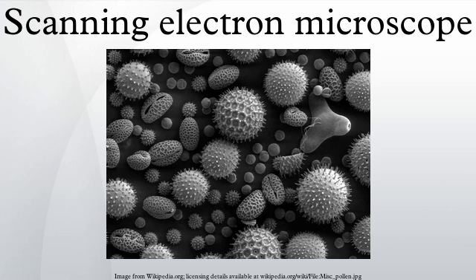Backscattered electrons are beam electrons that are reflected from the sample by elastic scattering. BSE are often used in analytical SEM along with the spectra made from the characteristic X-rays, because the intensity of the BSE signal is strongly related to the atomic number of the specimen. BSE images can provide information about the distribution of different elements in the sample. For the same reason, BSE imaging can image colloidal gold immunolabels of 5 or 10 nm diameter, which would otherwise be difficult or impossible to detect in secondary electron images in biological specimens.